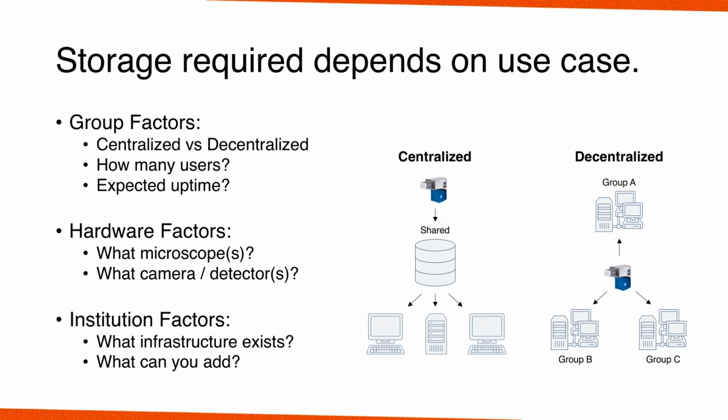There's two models that I really see used a lot. There's a centralized storage model where, say, a facility will get together, they get a K2 detector and a microscope, and they pipe it into a big vat of storage, right? Maybe a couple petabytes, and then they all have their own computers where they do their processing on the centralized storage. Everyone gets along. Eventually, it starts to fill up, and you just have to start archiving things, as I said before.